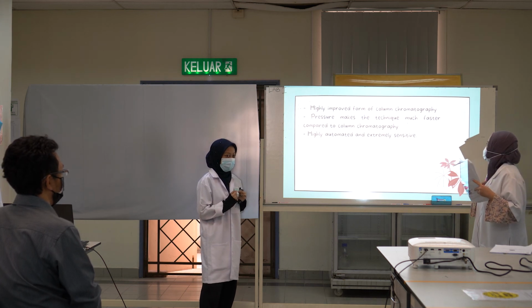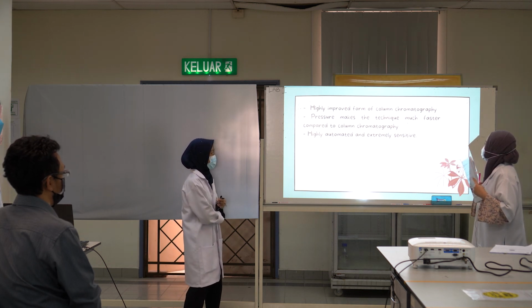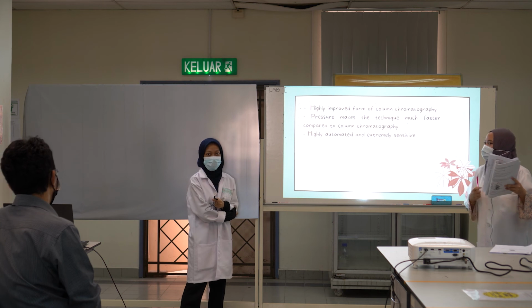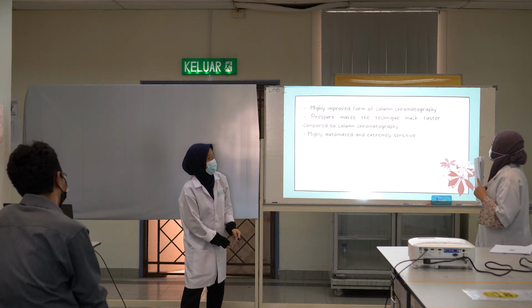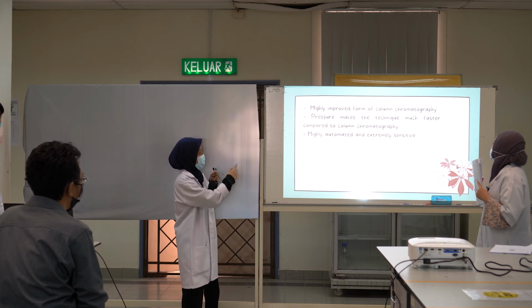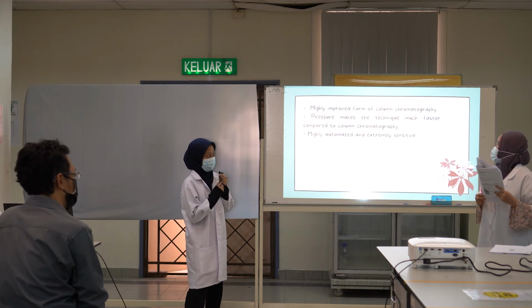Is it because of the pressure? Wait. It says highly improved form of column chromatography, so what makes the HPLC the improved form of column chromatography?